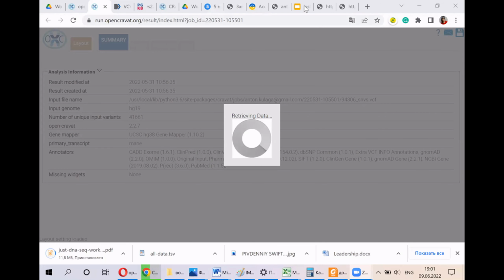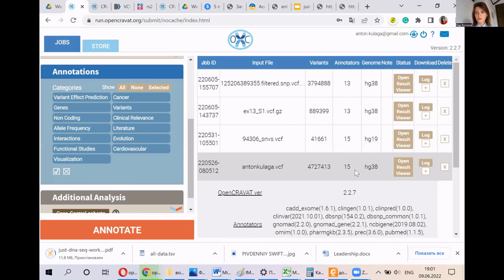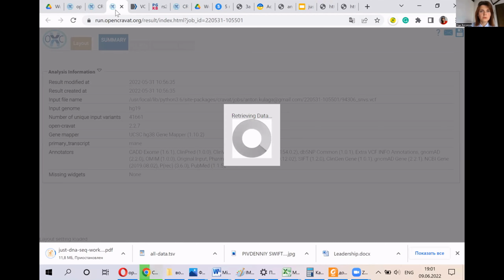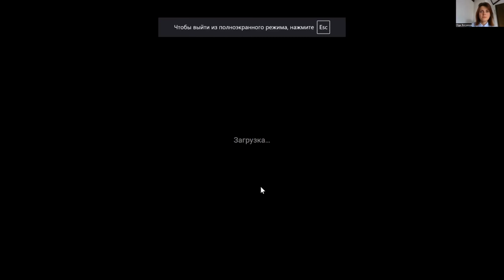Okay, so we can just move to the presentation and see what we will do next after the analysis. Maybe I have to do it one more time. Maybe it will be faster. I don't know. Okay. After it will be downloaded, what are we going to do?